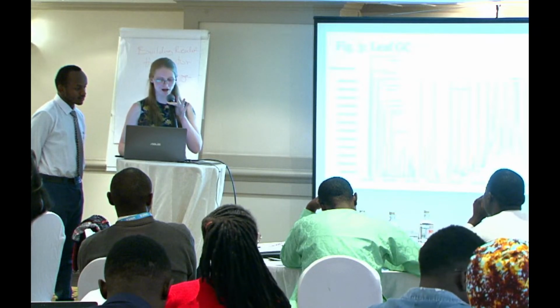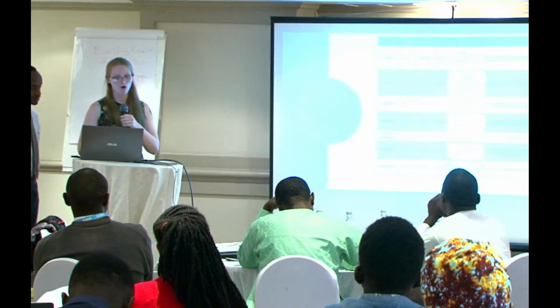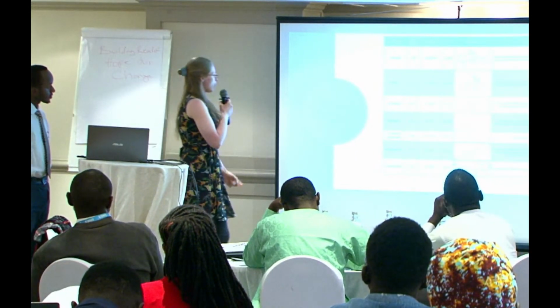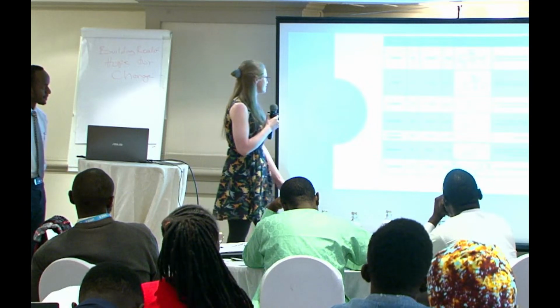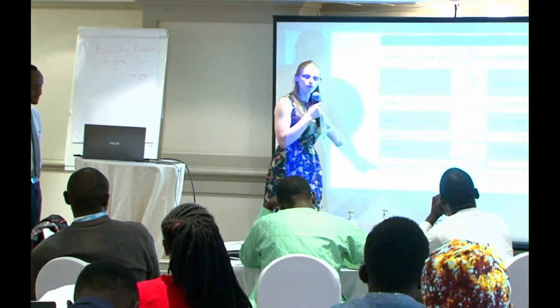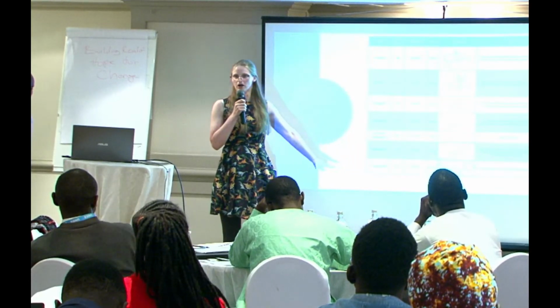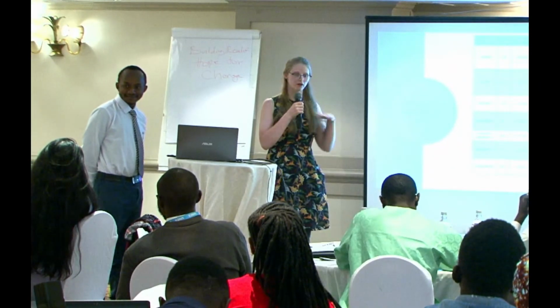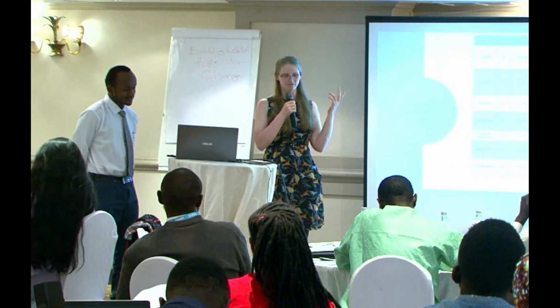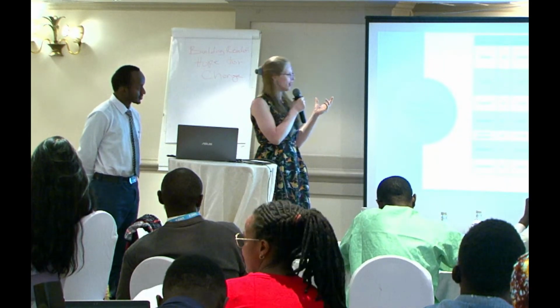And so this is the figure for our leaf GC. Now, for root, this was probably the spiciest one, because we found tropacocaine in our plant, which I thought was cool. It's kind of like cocaine, except 50% as effective. All natural, I guess.